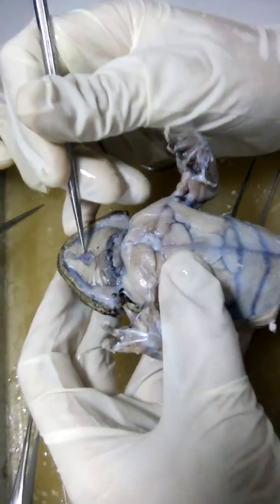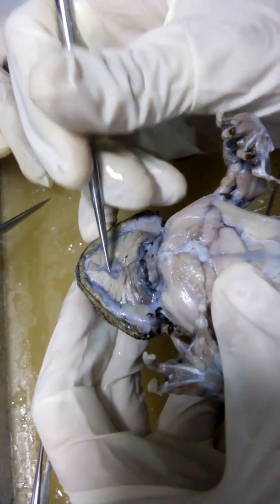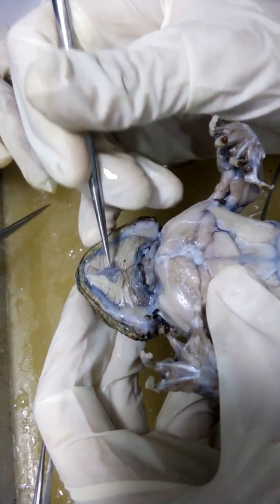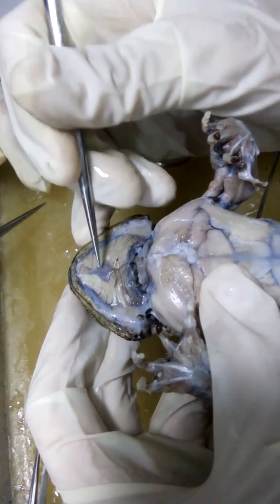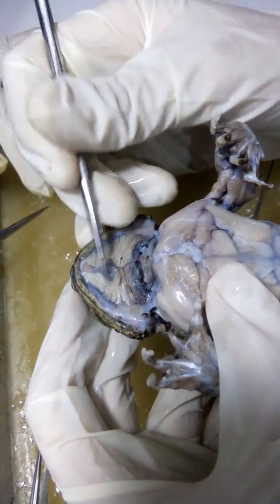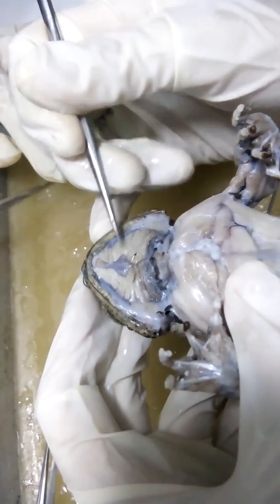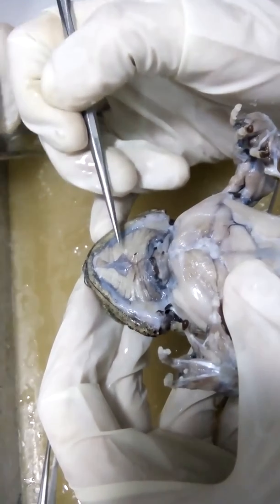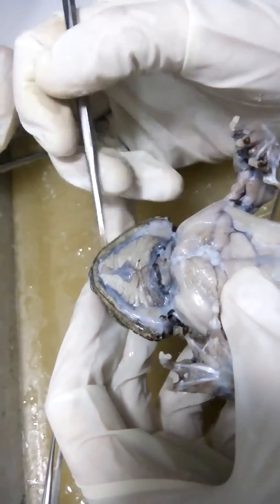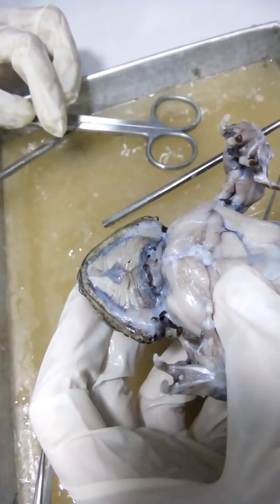Okay, so let's look at the ventral portion of the head region. This right here, this diamond shaped cartilaginous part, this is your median raphe. This is the superficial muscles, superficial lateral shape ng mga strand. This is your mylohyoid.